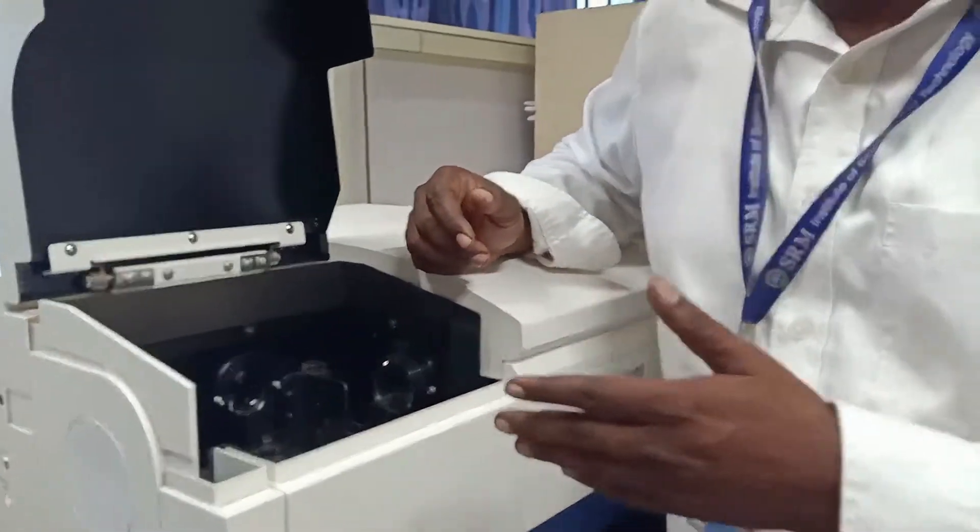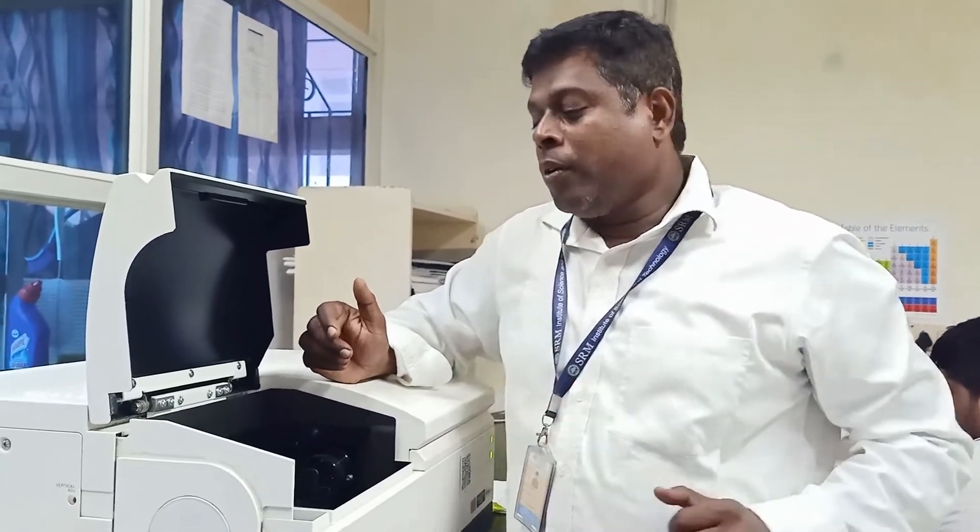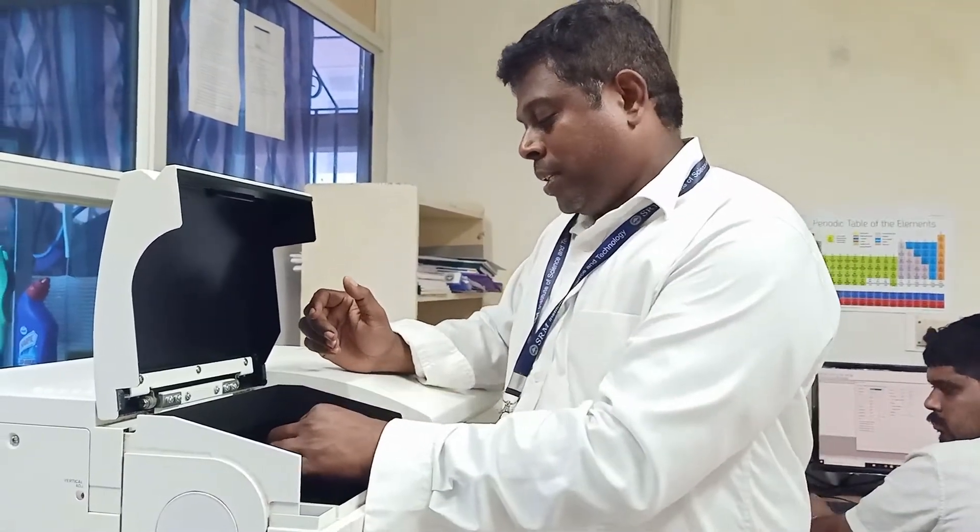This is exactly opposite to that of the UV spectrometer, where you have a detector directly across the sample and the absorbed light is measured. Here, we are measuring the fluorescence, which is why the fluorescence detector is placed at 90 degrees to the sample light path.